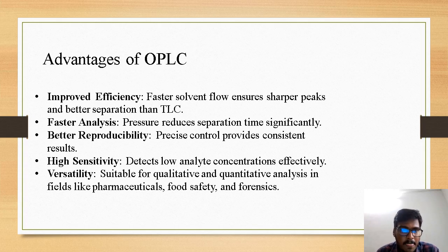Advantages of OPLC: improved efficiency, faster solvent flow ensures sharper peaks and better separation than TLC. Faster analysis, pressure reduces separation time significantly. Better reproducibility, precise control provides consistent results. High sensitivity, detects low analyte concentrations effectively. Versatility, suitable for qualitative and quantitative analysis in fields like pharmaceuticals, food safety, and forensics.